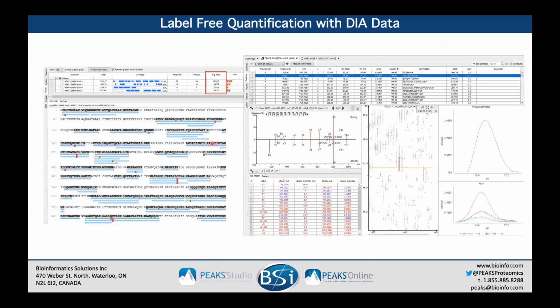When we go in to look at that further, look only at these 4 particular proteins that are spiked into the mix, we find that, you know, with larger proteins, we have more peptides. That's expected in this case, but we do have excellent coverage of all 4 of these proteins searched in the library. And again, an example of a particular peptide.